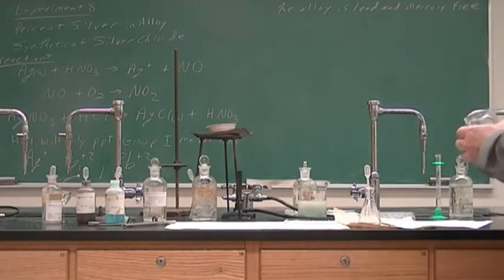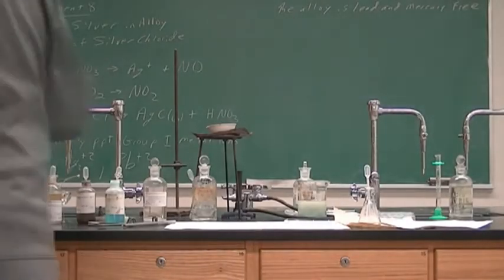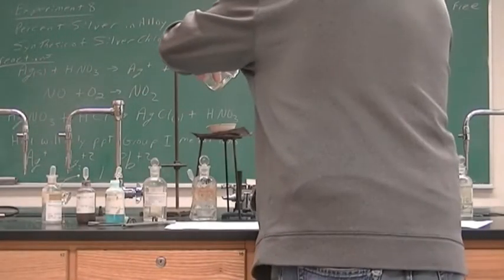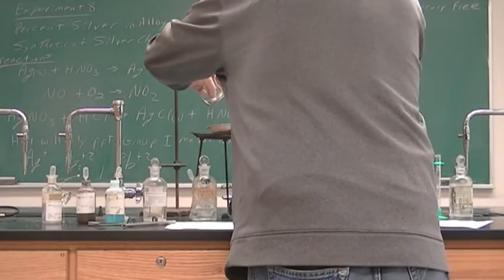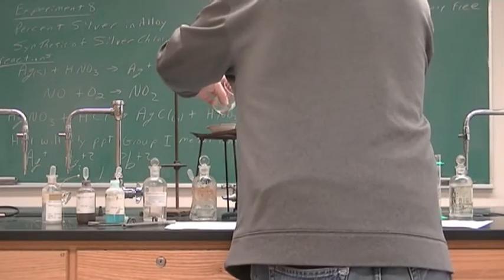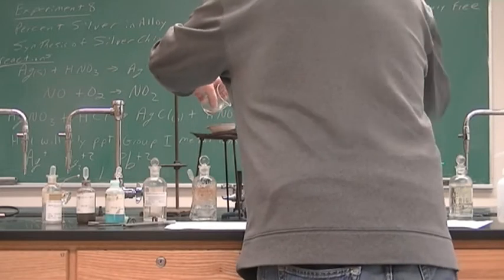All right, so now we will get our spatula, and we are going to then transfer the silver.